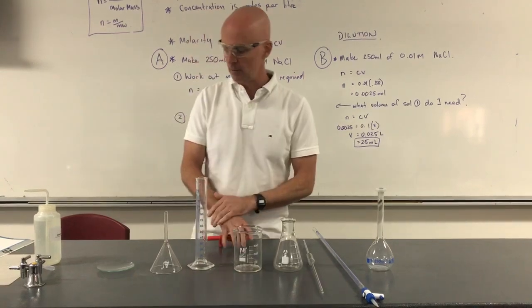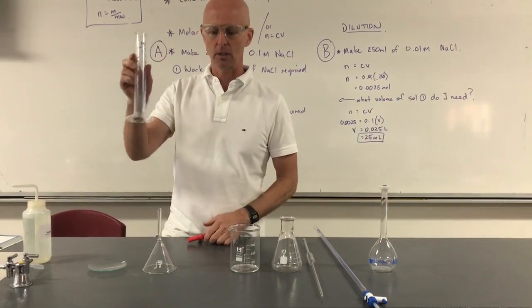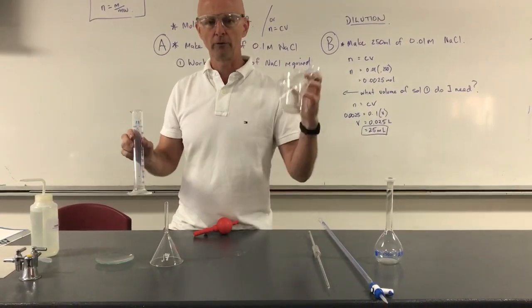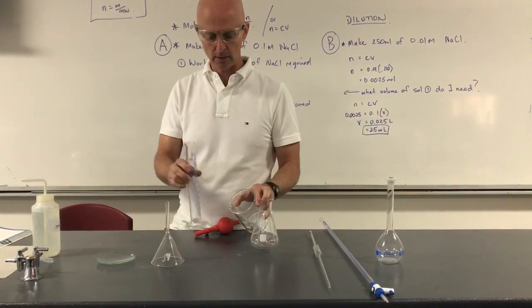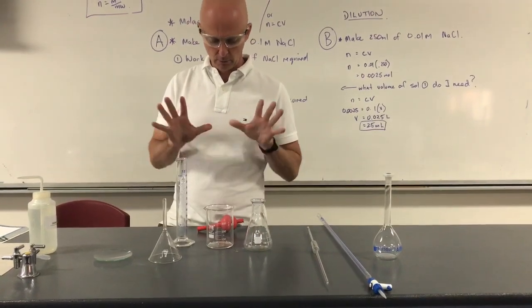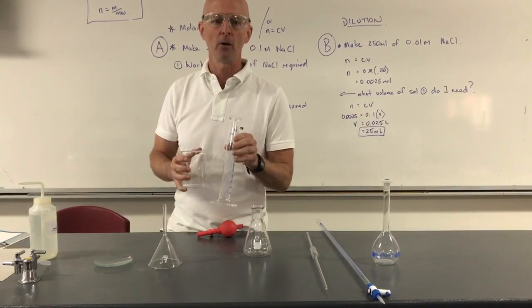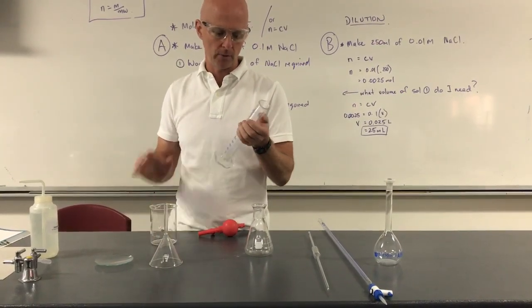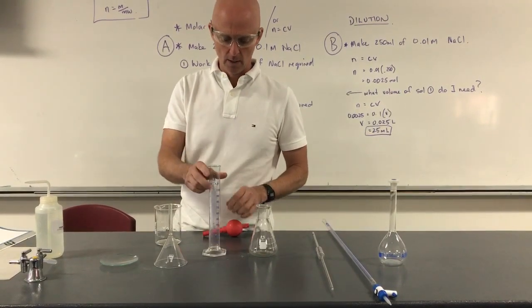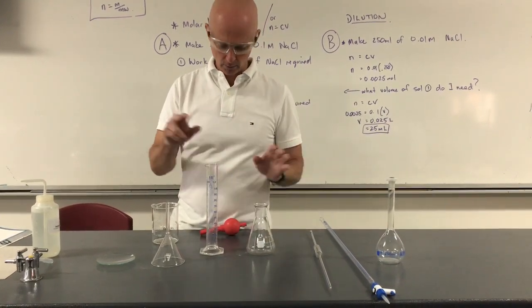And I want to take you through some of these things that we use. Things that you're familiar with, like a measuring cylinder or a beaker or a conical flask. So you should know the names of these three things. They're quite obtuse sort of measuring devices. They've got gradations on them, but they're not very accurate. So this one might be up to plus or minus half a mil in terms of its accuracy. So while you think it might be fairly accurate, it's not really, and that's why we have these other things which I'm going to explain to you.